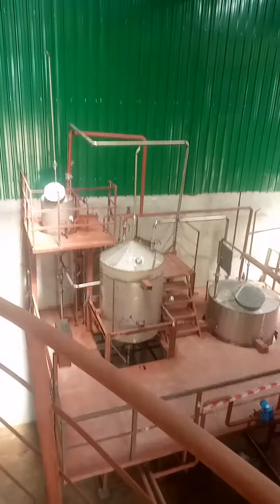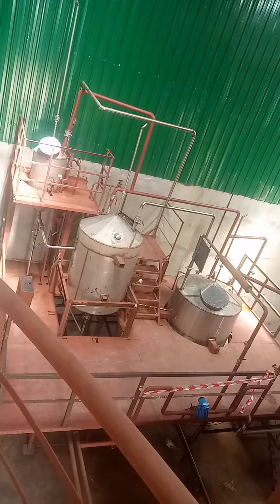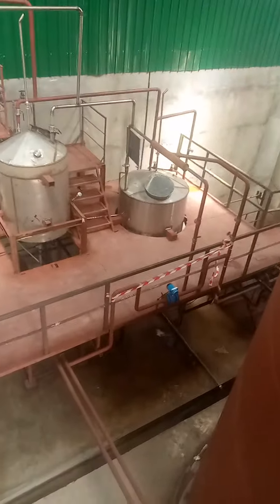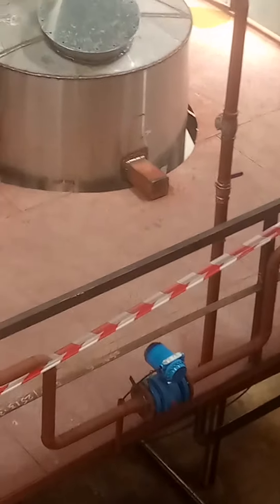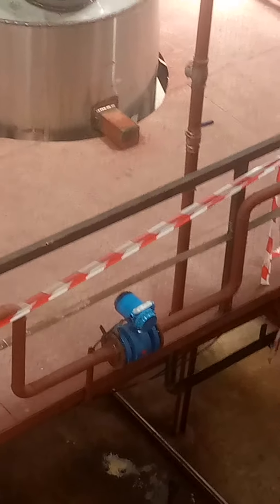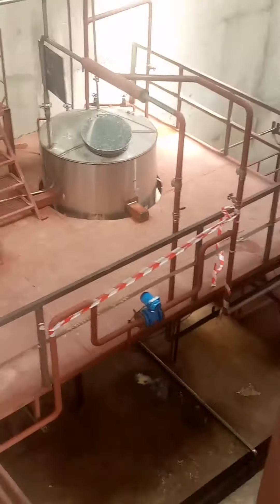The culture vessels you're seeing over there have been installed and we tested them — they're working so well. There you see we have a flow meter. We normally gauge the amount of water we send to either our culture vessels or the pre-fermentation section in the fermentation.